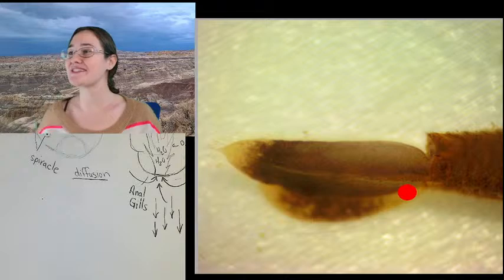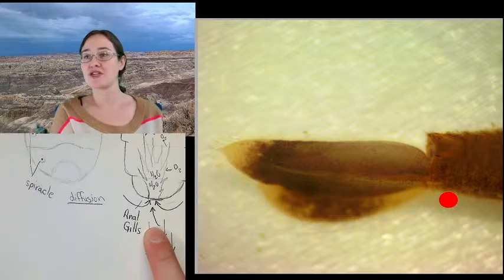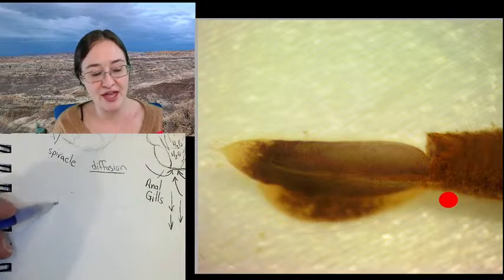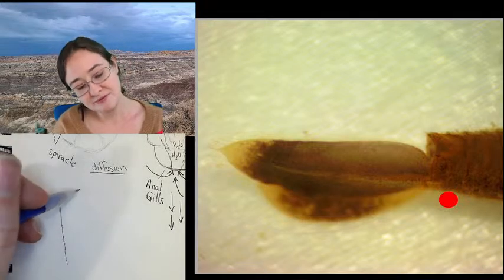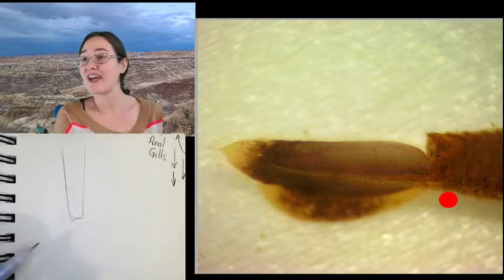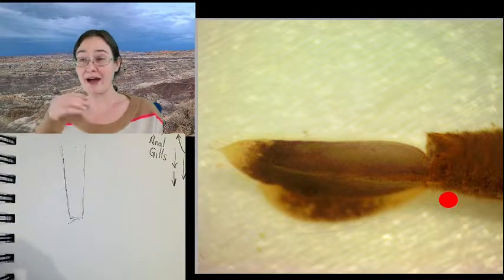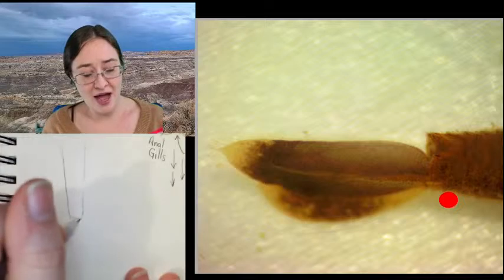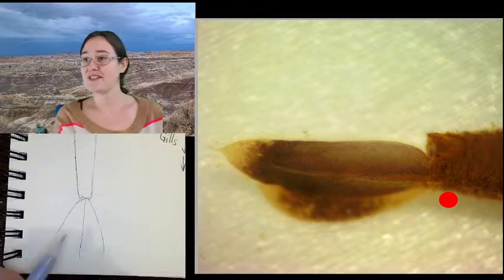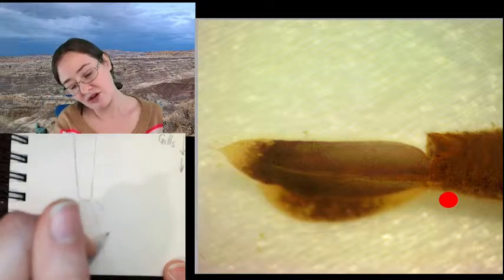So when we're looking at this damselfly, this is the end of its abdomen. And instead of having internal anal gills, my damselfly has a very thin abdomen. And then at the very, very end, they have three what almost look like tails. But these are actually gills. They'll have this kind of center stalk, almost like a feather, and then they come out and they move in.